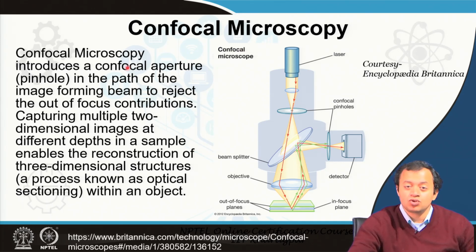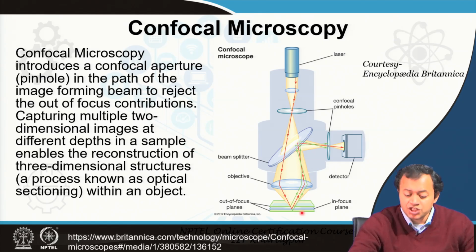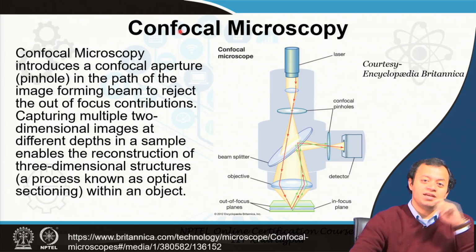So, confocal microscopy is a spatial filtering microscopy, spatial as in space based, as in length based. It uses a pinhole to allow only the focused light, the light that is coming out after scattering or after getting reflected from the sample, especially in a non-smooth, different height sample. Few of the light waves are in focus, few of the lights are out of focus. It only takes the focused light. Now, combine confocal microscopy with scanning microscopy.